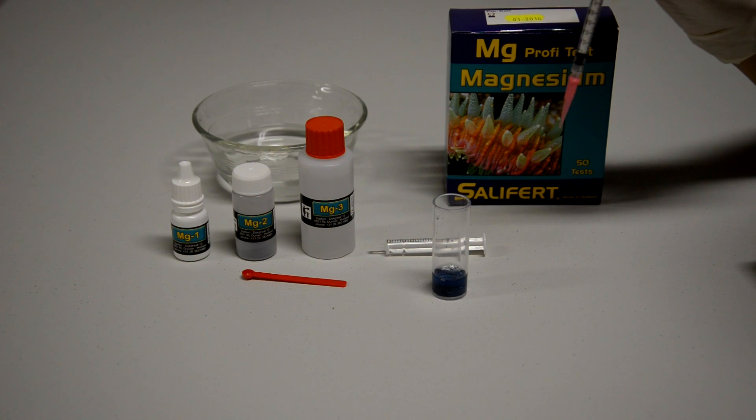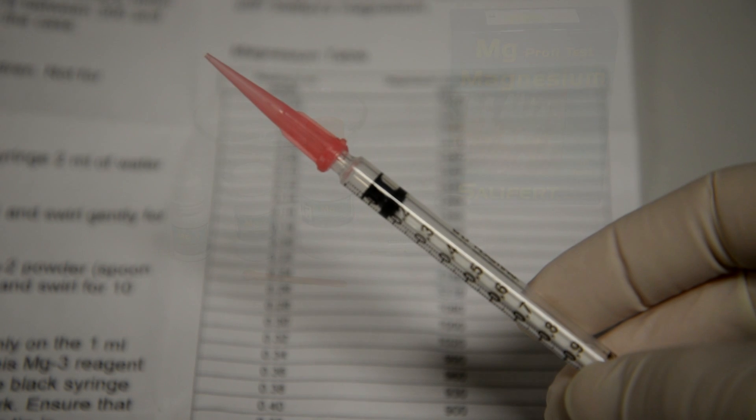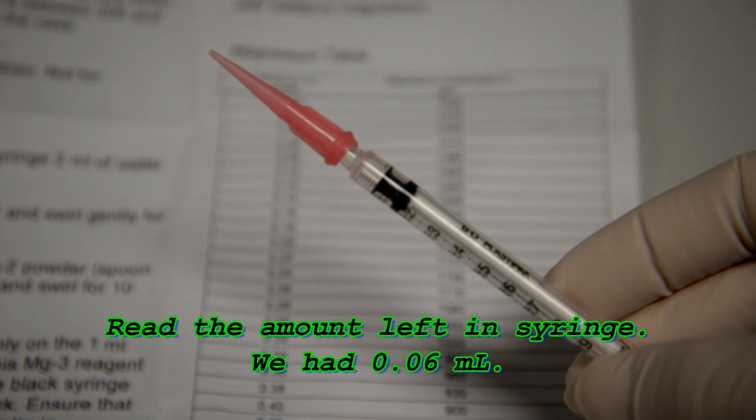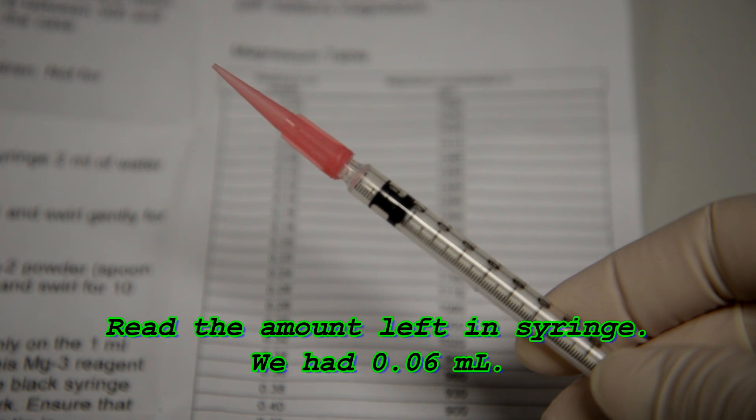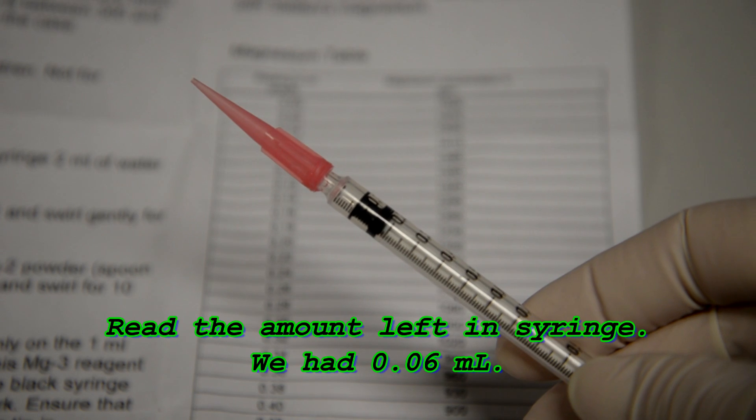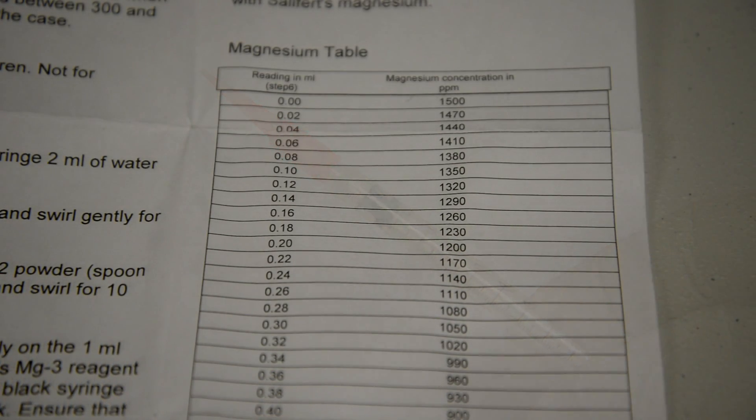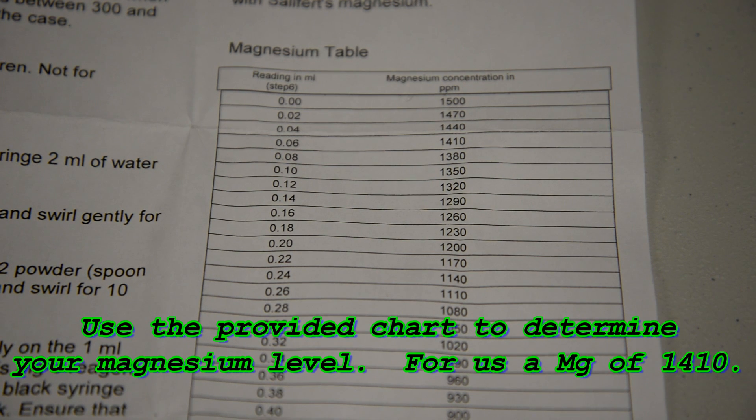We're going to take our syringe, flip it over, and read the amount of magnesium three reagent that's still in our tube here. And it's hard to read, but we have 0.06 mLs left in the syringe.